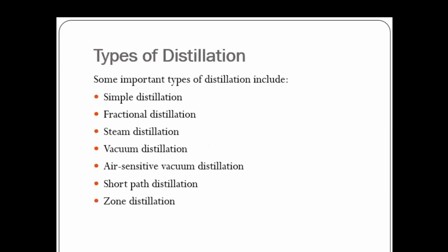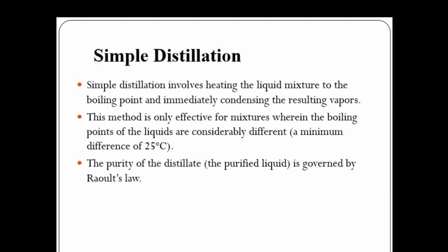So if you see the types of distillation, some important types include simple distillation, then fractional distillation, then steam distillation, vacuum, air sensitive, short path, and zone distillation. So these are the different types of distillation. Come on, this slide is the simple distillation.